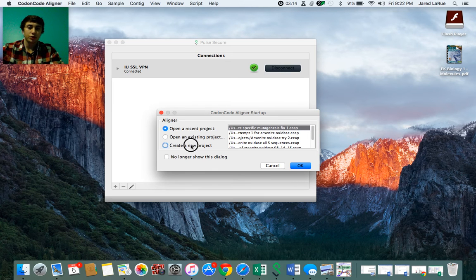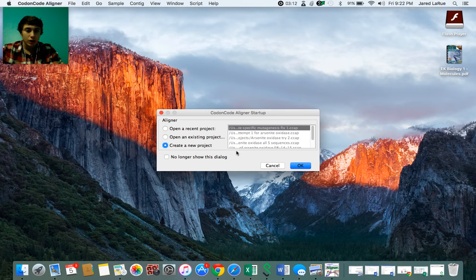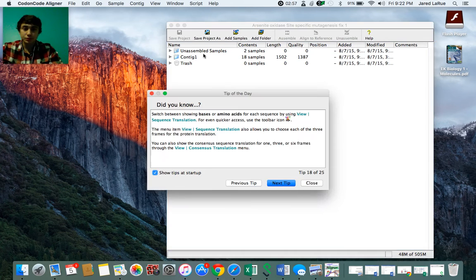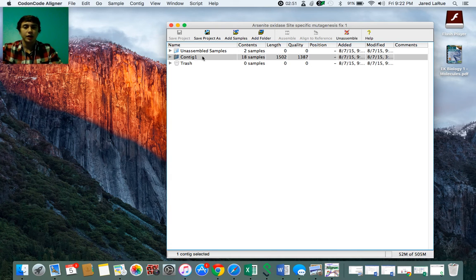So what you're going to want to do is, once you're logged in here, if you have a new project, you're going to click create a new project. And what you can do is from there just upload your files that you want to mess with. I'm just going to open a recent project. It'll be easier. So you just open it. It gives you a tip of the day. Here's a little thing you didn't know about our software.